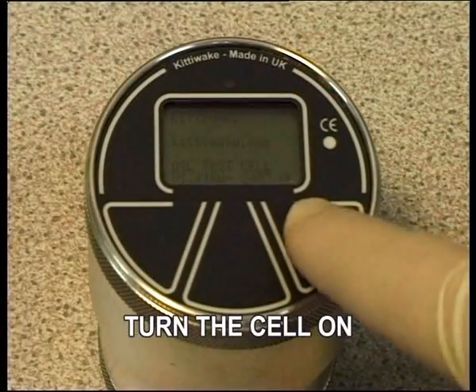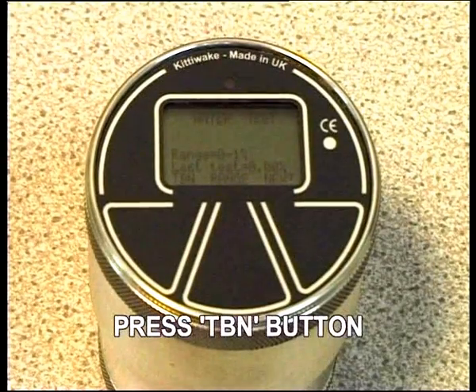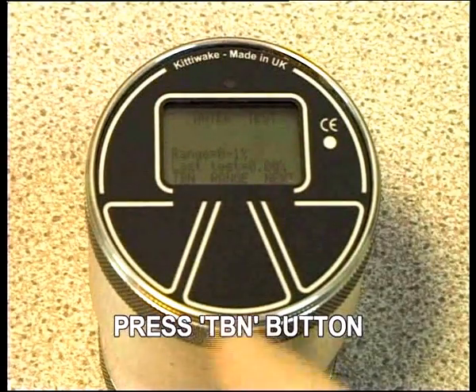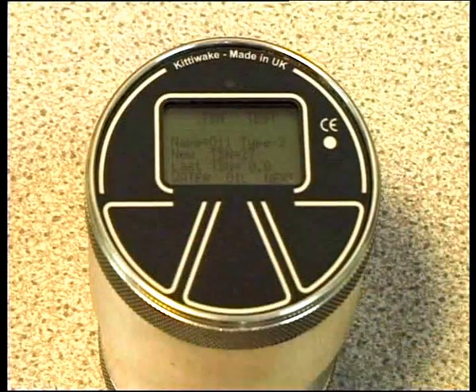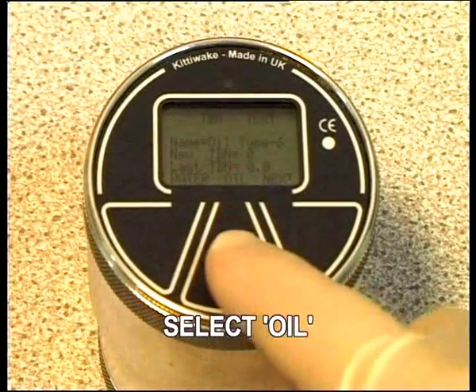Press the right-hand touchpad to switch the cell on. Press TBN to switch to the TBN mode. Press Oil to select your specified oil.